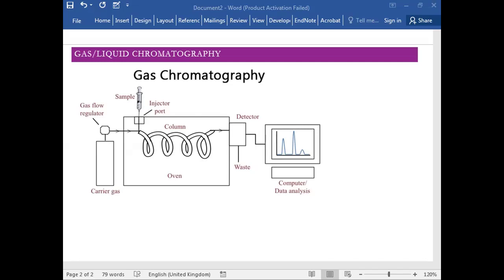I'll make it easy for you. Consider this: you have rocks, and those rocks are coated with wax. ये consider कर लो, visualize कर लो. This will help you understand what is technically happening. Now, wax is supposed to be something. Wax, तुम लोगों के दिमाग में, it is supposed to be a non-polar sticky substance.